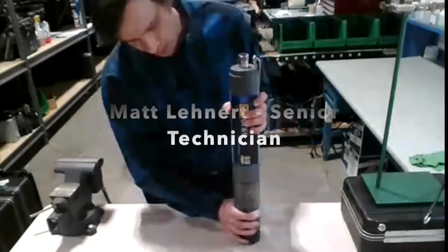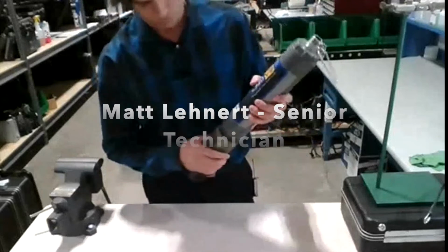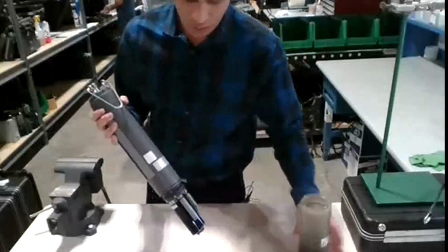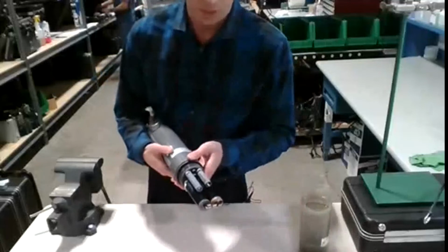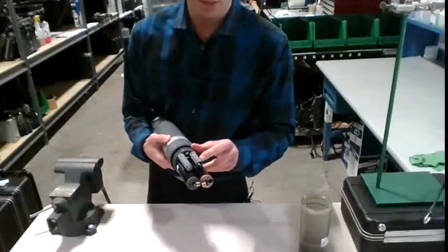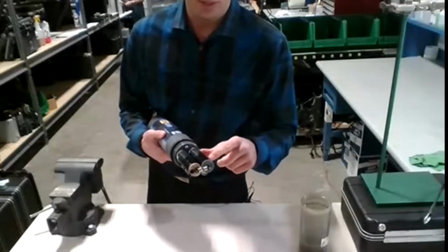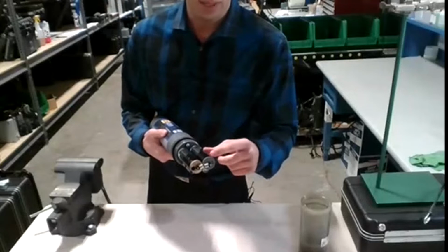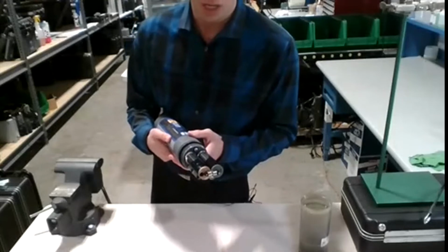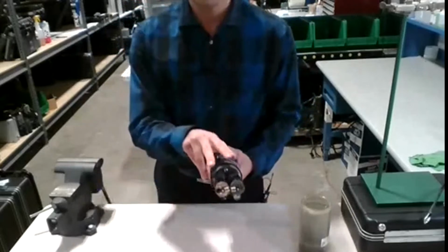I'd like to actually show you the YSI 6920 and what sensors we have configured on it right now. So I just had my calibration cup here, but I'd like to point out, if the camera is visible, this is our pH sensor, which also has ORP next to it. This is our conductivity sensor, and then the two big bulky ones that we get questions about all the time. This one in here with the white plating or the gray plating is our turbidity sensor, and then our other sensor here is our dissolved oxygen. So this unit here is a V2, meaning it has 2 optical ports.